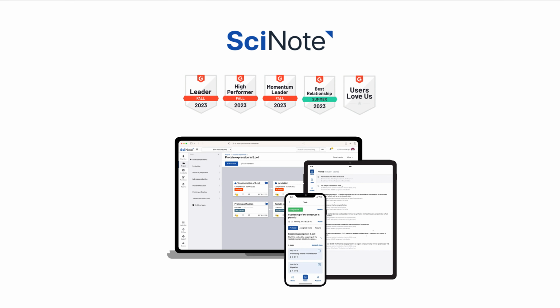With this, I would like to conclude this short walkthrough, and I would like to invite you to start using SciNote's Quartzy integration as soon as possible.